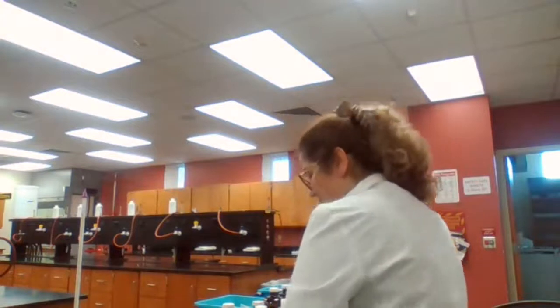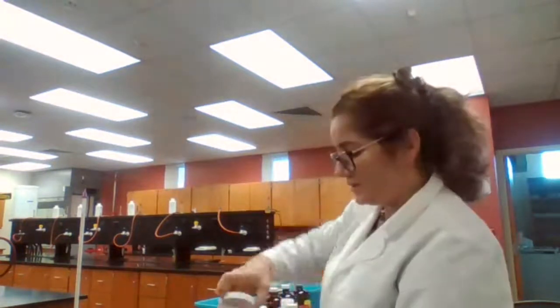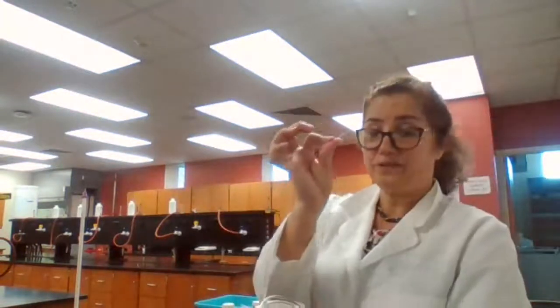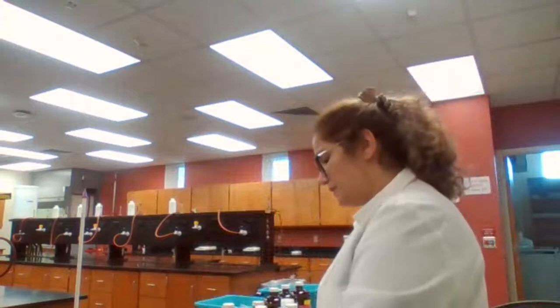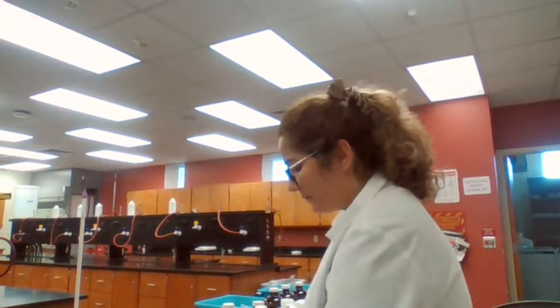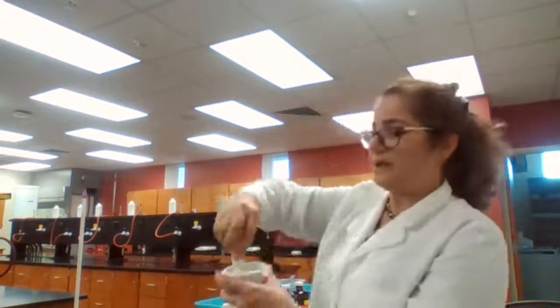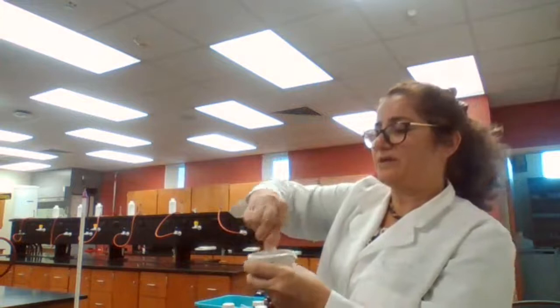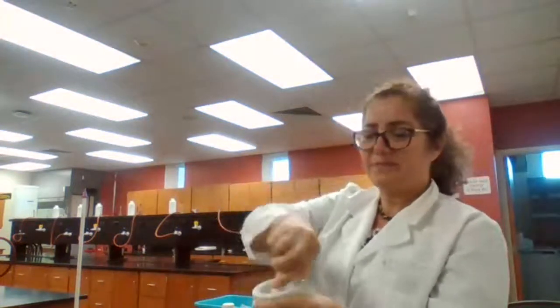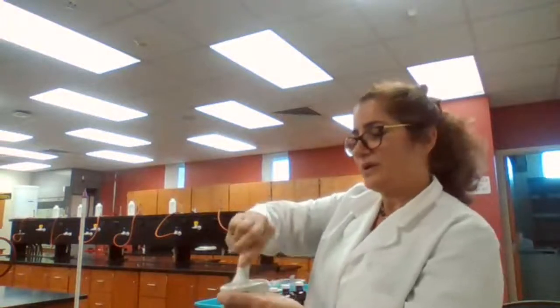And we're going to look at the sample. The crystals are too large, and they are not going to fit into the capillary tube. So I'm going to take some of the sample and grind it using a mortar and pestle. We're going to grind the sample. Why do we have to grind the sample? Because large crystals are not going to fit into the capillary tube.